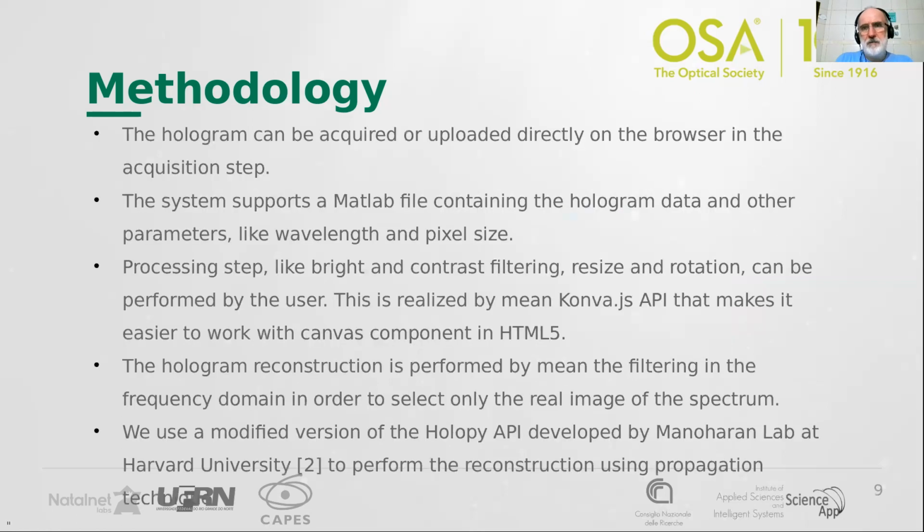So since we have these images, the hologram can be input in our method from this equipment, or we can also save it and get it from our web-based platform, from some computer machine. So this is acquisition, no matter where it comes from. Our system supports a MATLAB file, so after this phase, we will work in MATLAB. And this MATLAB file contains the hologram data and other parameters like wavelength and pixel size and so on.